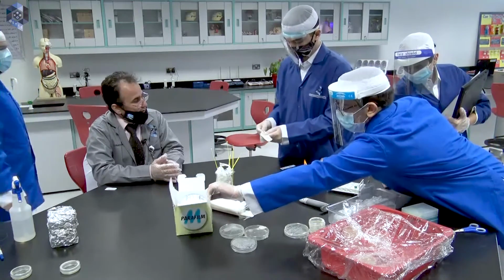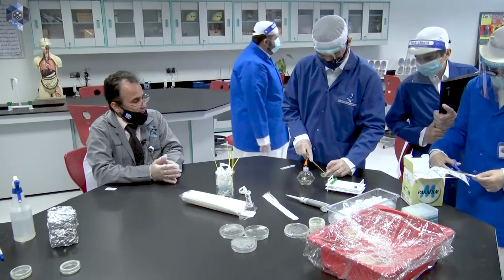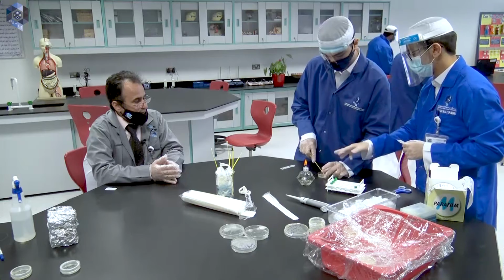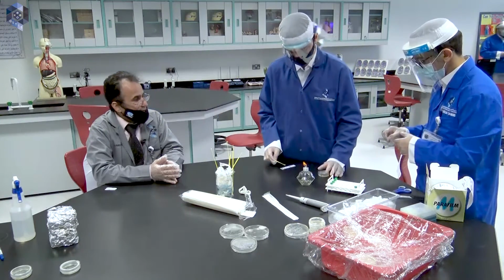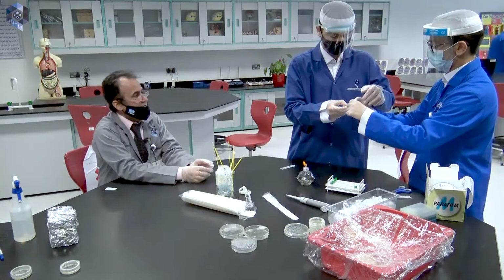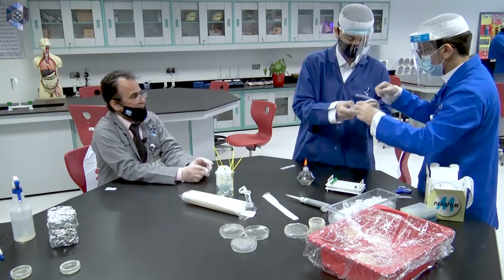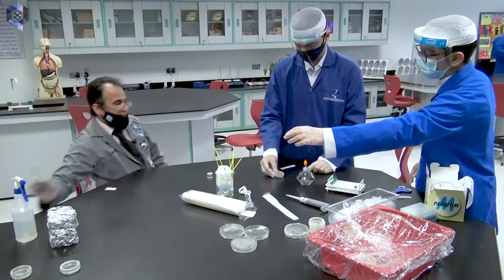Are you the last one? Are you all done with this? Okay, wrap it with parafilm. Okay, label it with your initials.